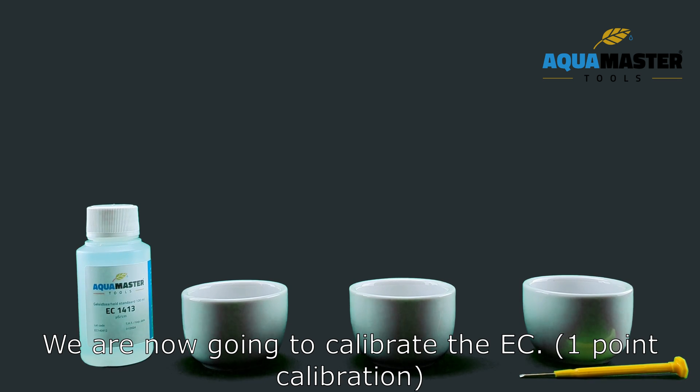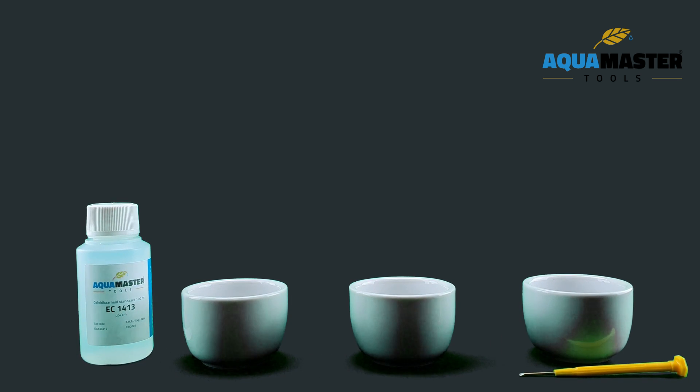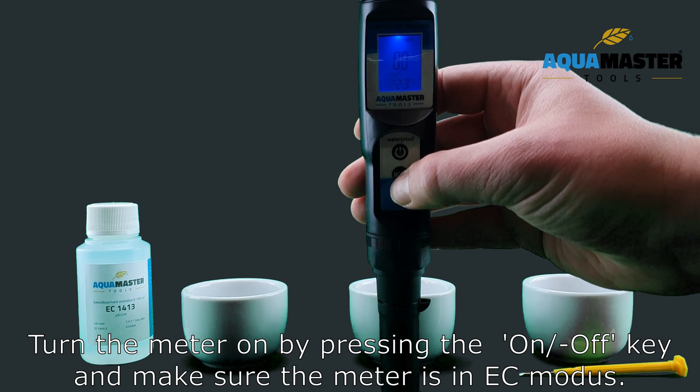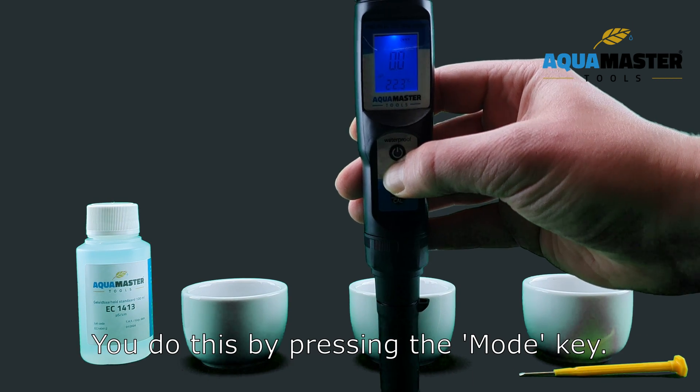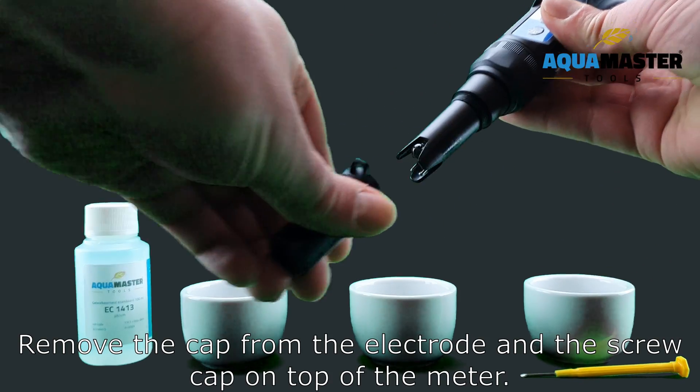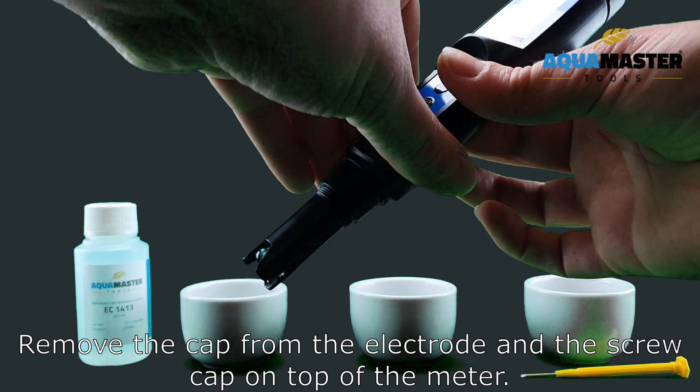We are now going to calibrate the EC. Turn the meter on by pressing the on-off key and make sure the meter is in the EC mode. We do this by pressing the mode key. Remove the cap from the electrode and the screw cap on top of the meter.